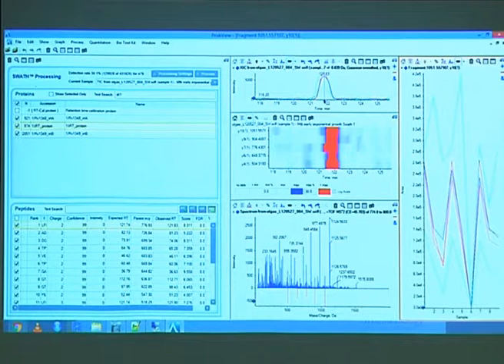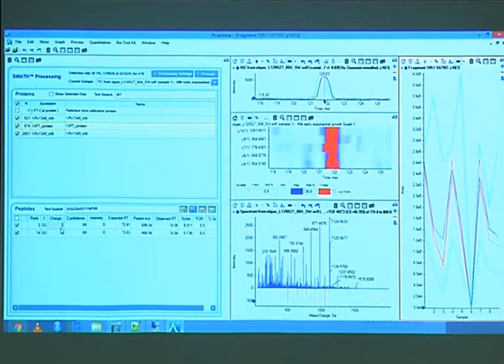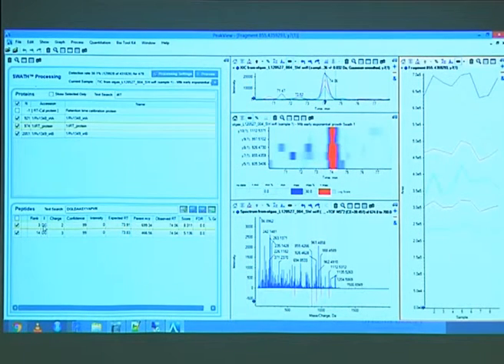Let's look at a nice example now. As you've seen, you can type in this search field and it will search the proteins, and you can type in a peptide down here and it will give you the peptide. In this case, only for the peptide sequence. You cannot filter for that. What you should look for in here.